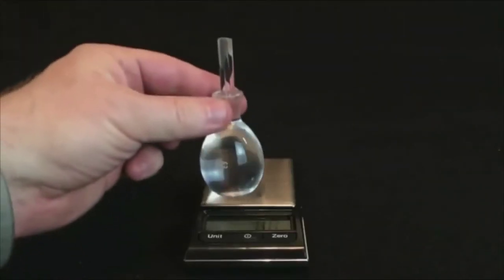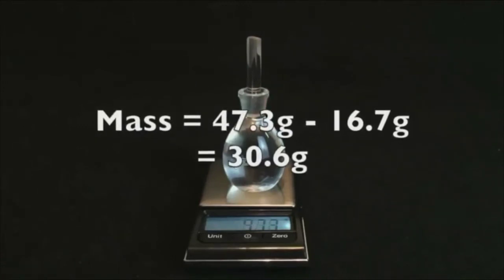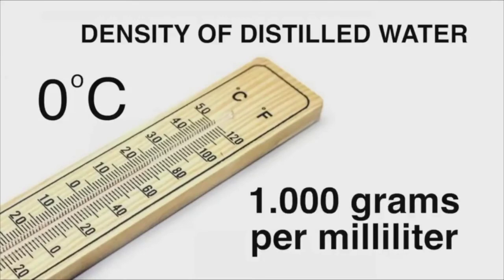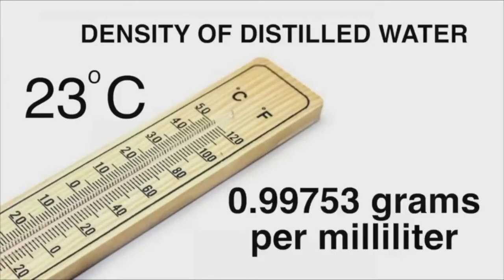The measurement can be done at a constant temperature. For group 2, the pycnometer has the advantage that during the weighing, the temperature of the solution can continue to be observed during the examination. In the use of a pycnometer, capillary pipes should be full of fluid.